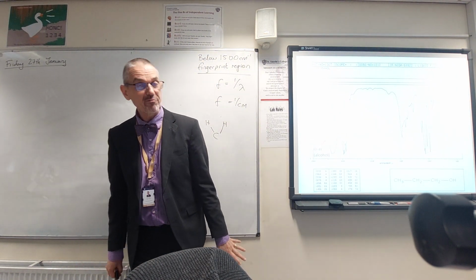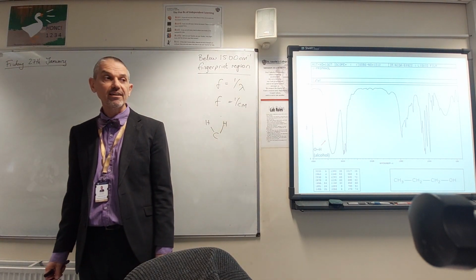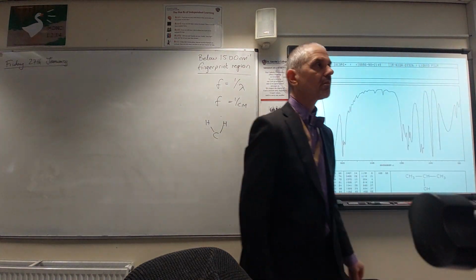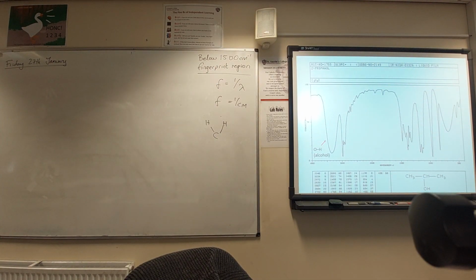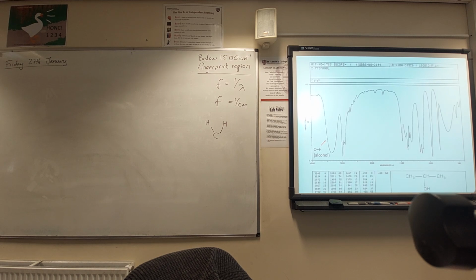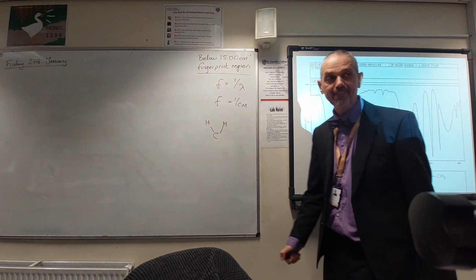The information we can get from this is that we're looking at an alcohol. It's propan-1-ol that we're looking at. Propan-2-ol looks very similar. If I flick between them, you can see the difference in this end. If you keep your eye on the fingerprint region, you can see that's changing a lot from propan-1-ol to propan-2-ol. But over here, it's hardly changing at all. That OH is staying as a big, broad peak, very identifiable, very clear.